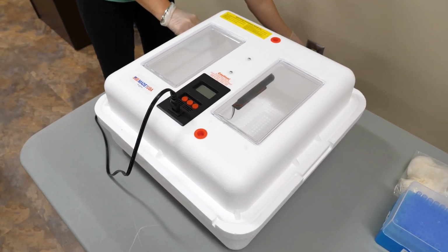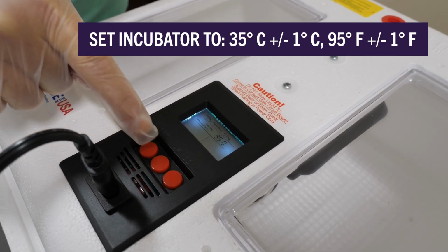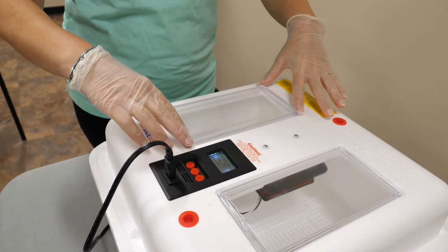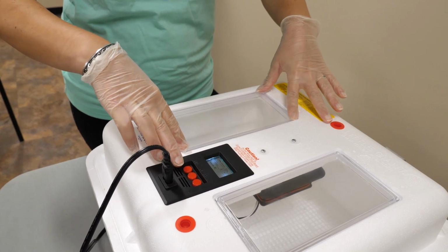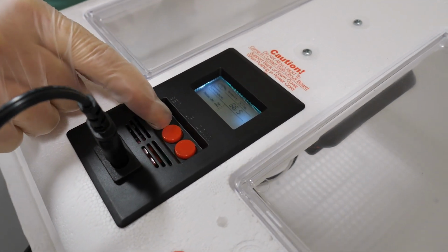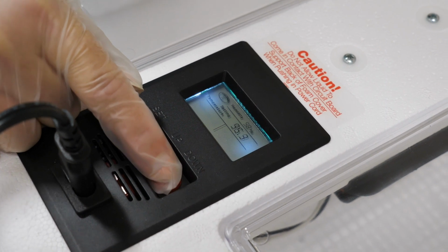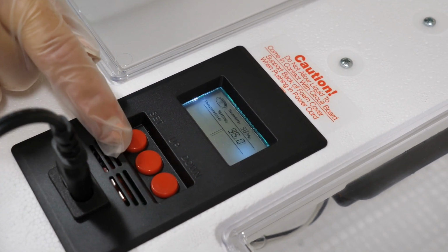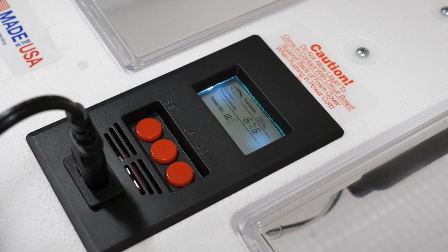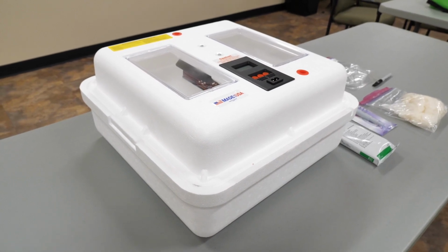Before you head to your site, the first step of the bacteria monitoring process is to turn your incubator on to 35 degrees Celsius or 95 degrees Fahrenheit. Make sure the plastic window pieces fit firmly in the styrofoam. Use the buttons on the top of the incubator to increase or decrease the temperature as needed. Press and hold the set button until the numbers flash to change the temperature. Press the set button again to lock in the temperature. Avoid placing the incubator in drafty areas or near windows.